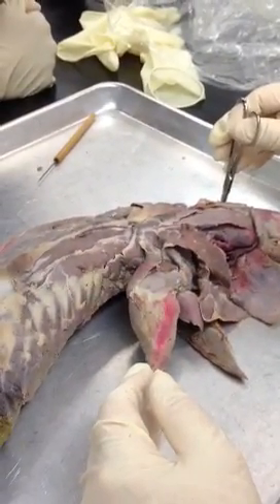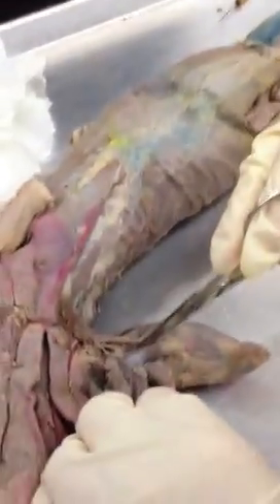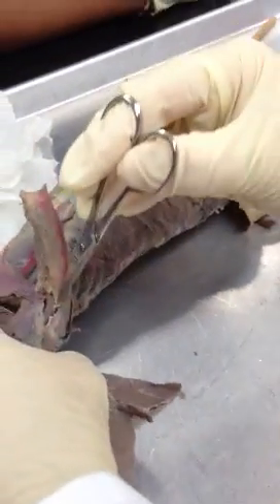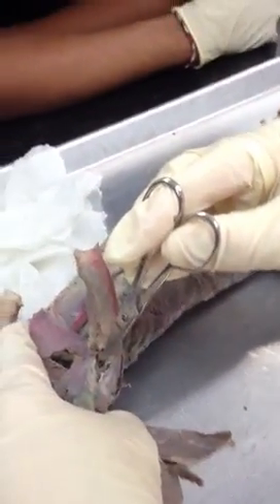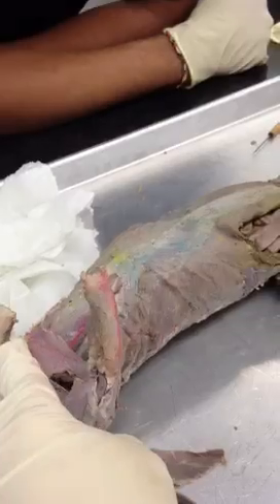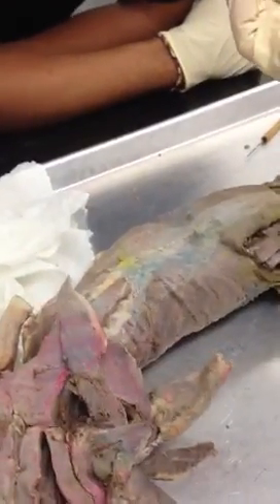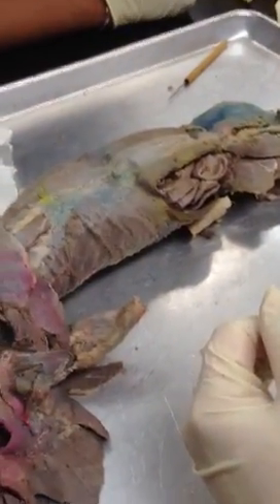So the biceps brachii — where is that again, versus the brachialis? The biceps brachii is on the medial side of the arm. Brachialis is on the lateral side of the arm. In minks, in humans, one is right underneath the other. In humans, biceps brachii is superficial to brachialis muscle. Remember, humans are upright like this — minks are on all fours. That's why the muscles are turned around a little bit.